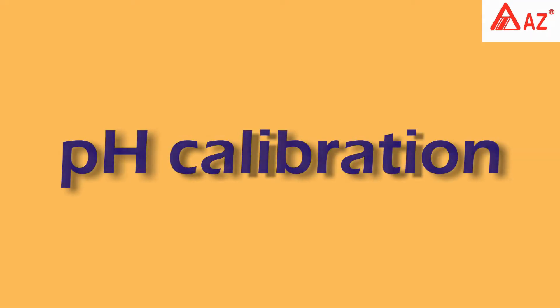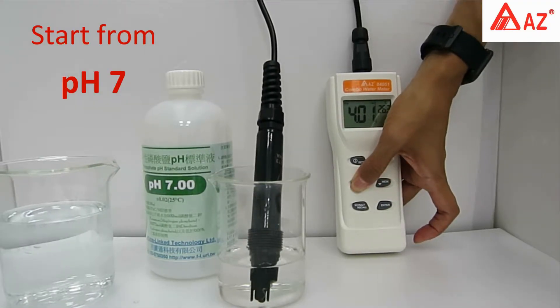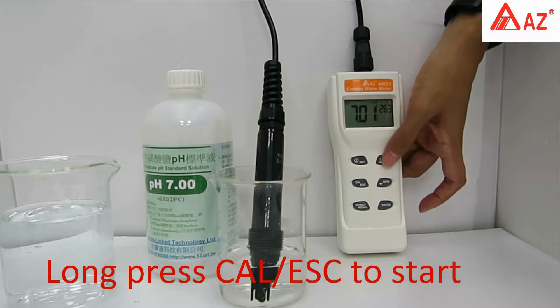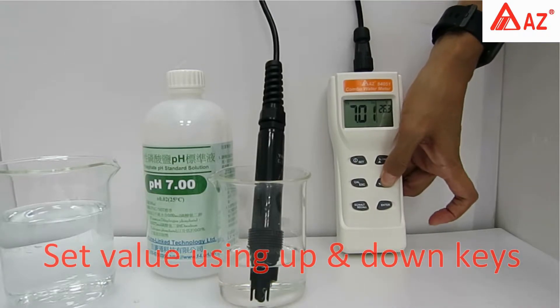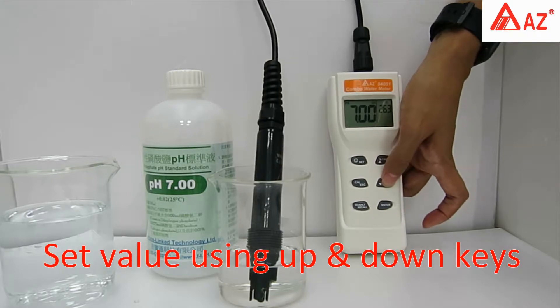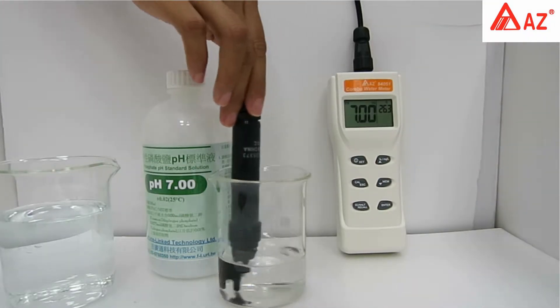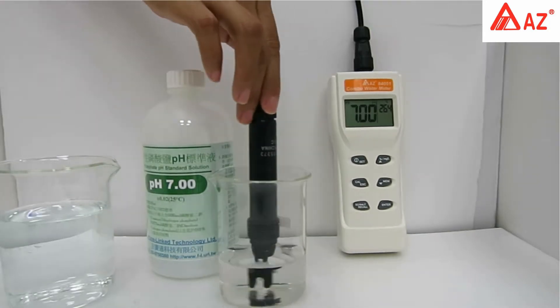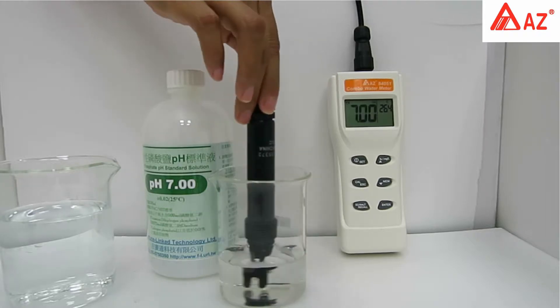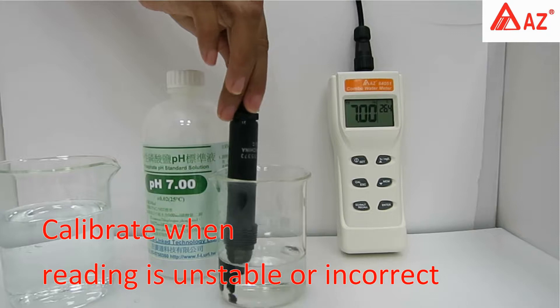For pH calibration, start with pH 7. Long-press Cal to enter calibration, then set the standard value using the up and down keys. Use a transparent container and make sure the pH electrode is completely immersed in buffer. Stir gently to get a homogeneous condition. Calibrate when the pH reading is unstable or incorrect.